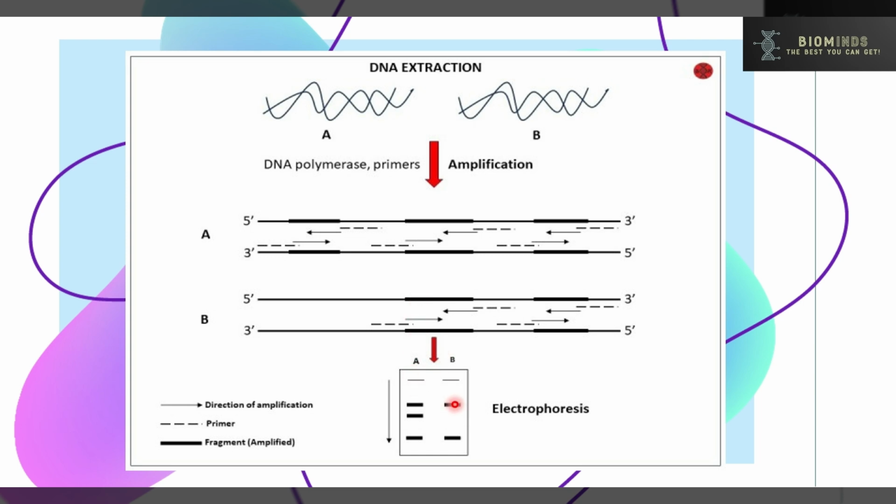So how can you conclude here? You can see these two samples are not from the same organism, or they do not share any heredity, or there is certain variation between them.